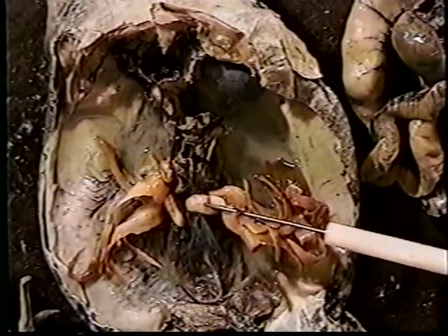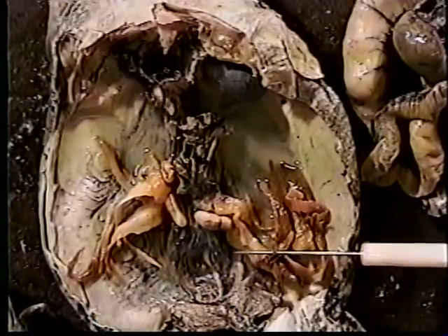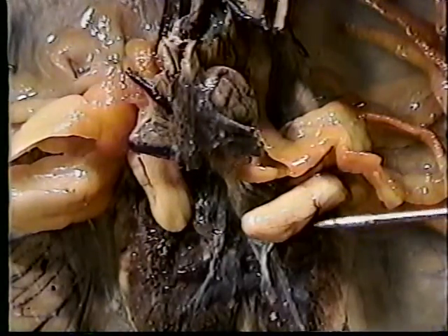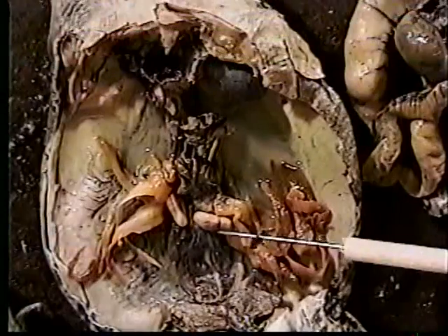I can tell that this is a male bullfrog. A couple characteristics give this away. First of all, on our male, we notice two testes, one to the right, one to the left. On the exterior observation of our frog, we notice an enlarged thumb pad.